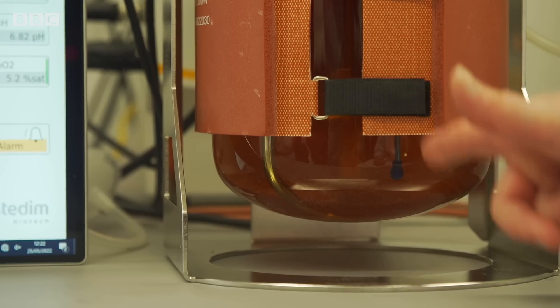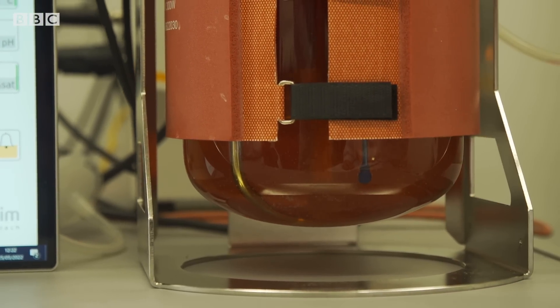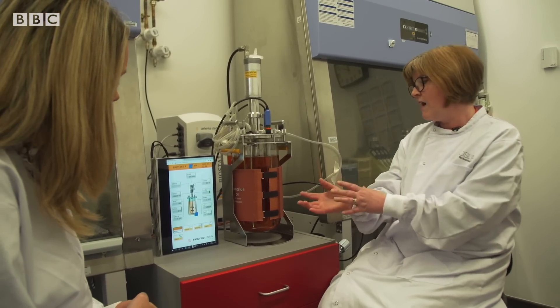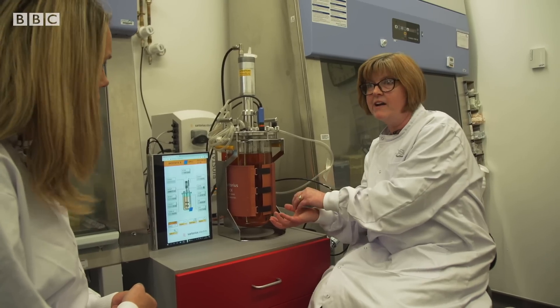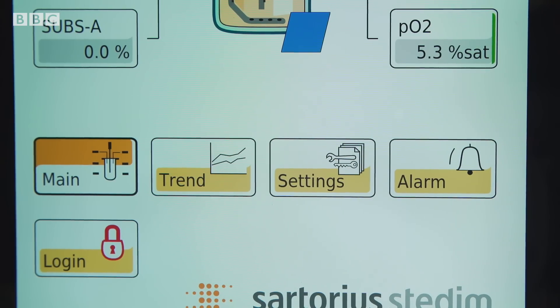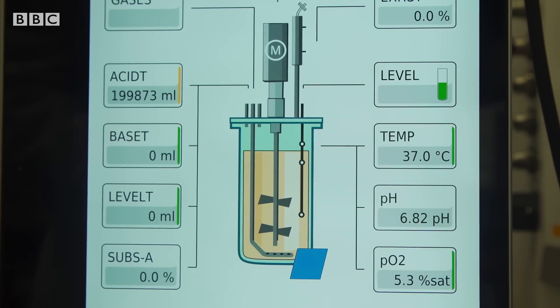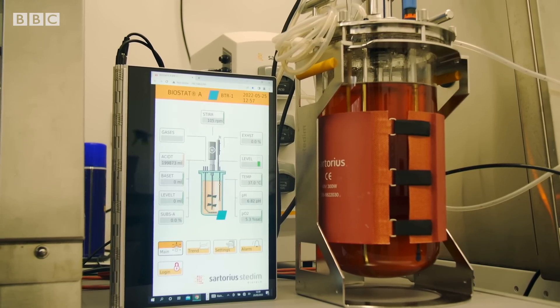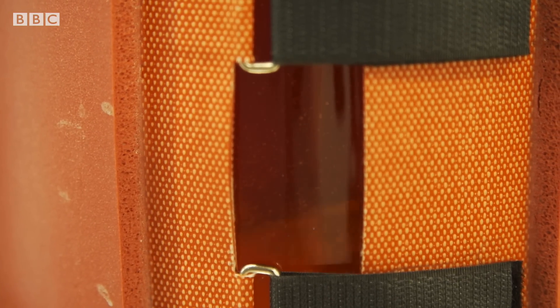We would share that data with our cultivated meat customers. Are these little flecks that we can see — meat? These are not individual cells. What we find is that the little piggy cells like to clump together and be with each other, which is great for cultivated meat because we don't have to add any special micro-carriers to let the cells swirl in solution. At this scale you're producing quite small amounts. If a company was doing this on a large commercial scale, what kind of size of bioreactor are we talking about? Several thousand, perhaps up to 100,000 litres for the full-scale cultivated meat companies of the future.